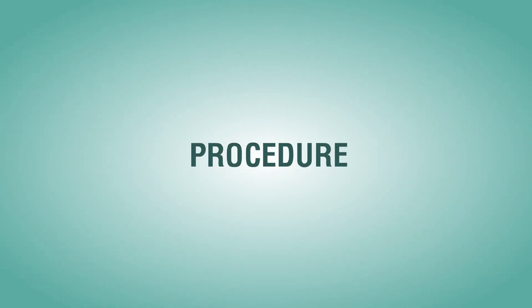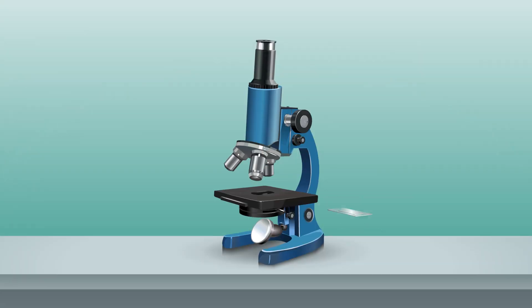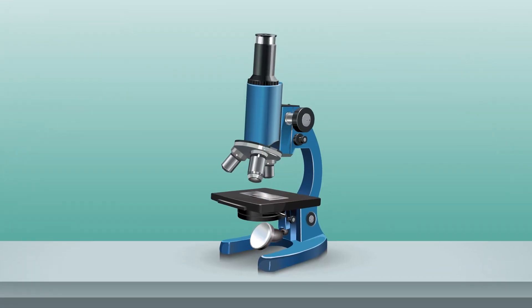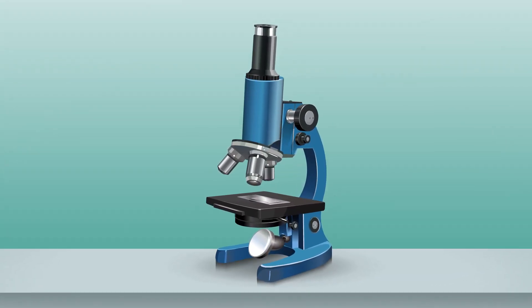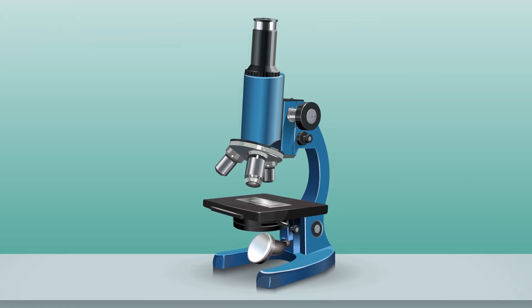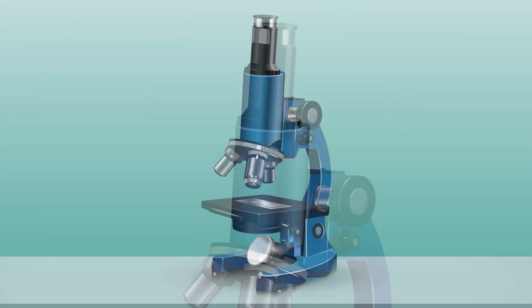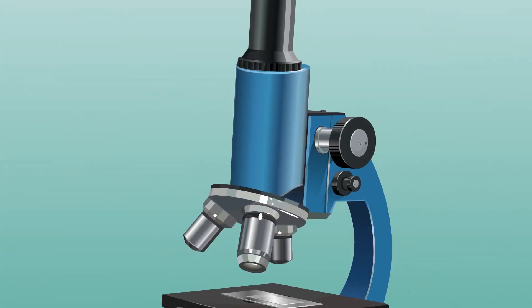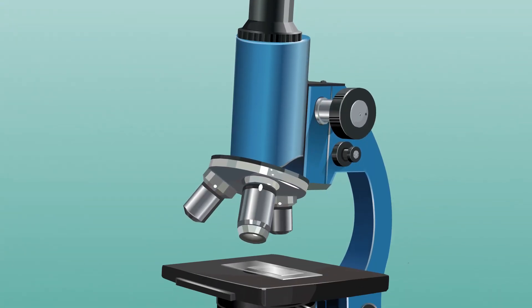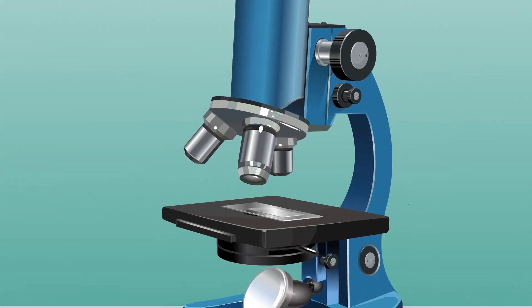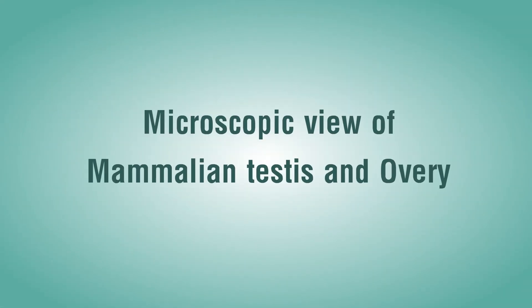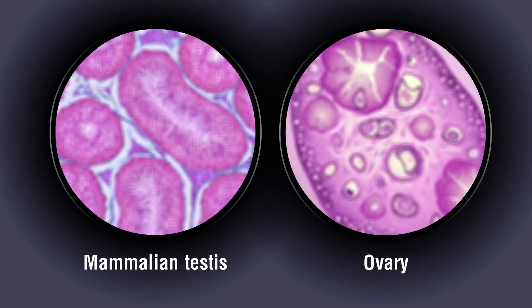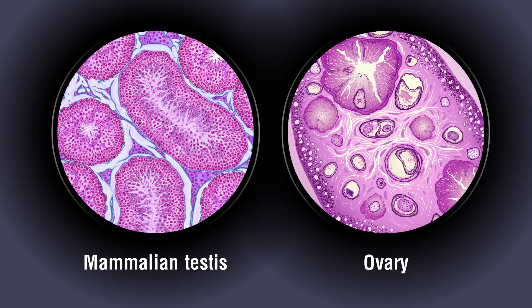Procedure: Place the permanent slide on the stage of the compound microscope and observe the slide first under lower magnification. Observe various stages of gamete development through the lens of the compound microscope. This is the microscopic view of mammalian testes and ovary.